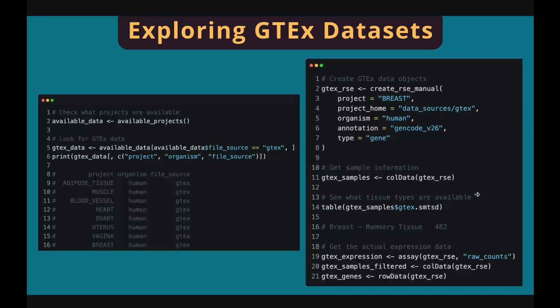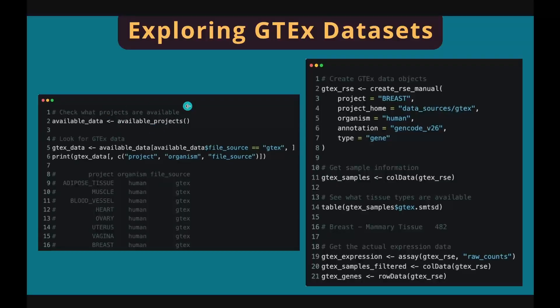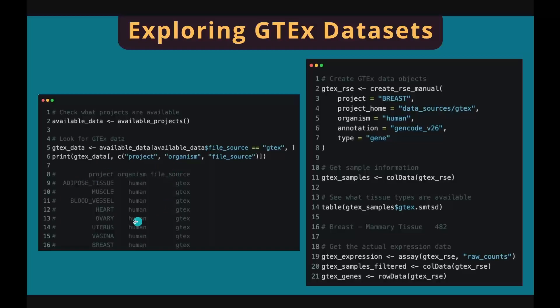Downloading gene expression from GTEx database is similar. We use available_projects function to retrieve the meta information of the datasets. This function returns a meta table that contains the information of all the datasets. In this case, we're only interested in the datasets from GTEx, the tissue types, and organism. So we can subset the entire meta table to display only the relevant columns.